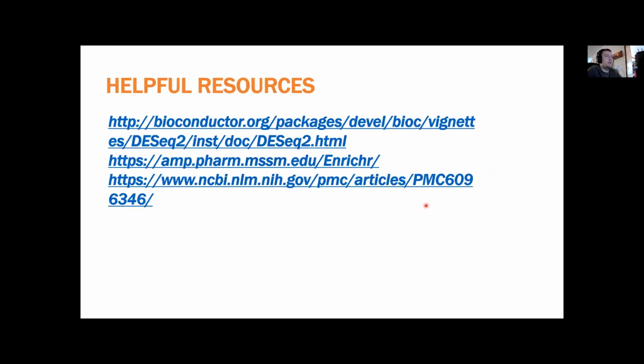And here are some helpful resources that might help you complete the tutorial or adapt some of this code to your own data set, if that's what you're interested in doing in the future. This is the DESeq2 vignette. It has a pretty good description of how to use DESeq2 as well as many different aspects of RNA-seq analysis. This is the EnrichR website, which you can use for your functional enrichment. And this is a paper that goes over some of the main principles for RNA-seq analysis.